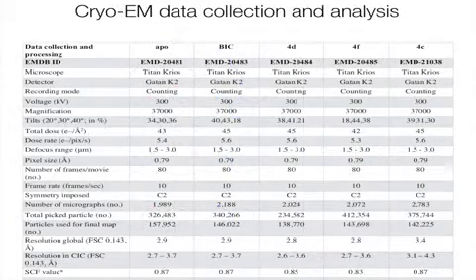Now, for those who are interested, this is our table 1. Just a few things to highlight here. We used the Krios with a K2 detector, operating in counting mode. We actually used a range of tilt angles from 20 to 40 degrees. Now, in principle, you only need 1, but we didn't know which one would work best, so we used a small range. We collected with a dose rate that would minimize coincidence loss on the K2, while at the same time maximizing the information content within each frame. So that was about 5 electrons per pixel per second. About 2,000 micrographs per data set, which after cleaning resulted in about 150,000 particles within each of the final maps.